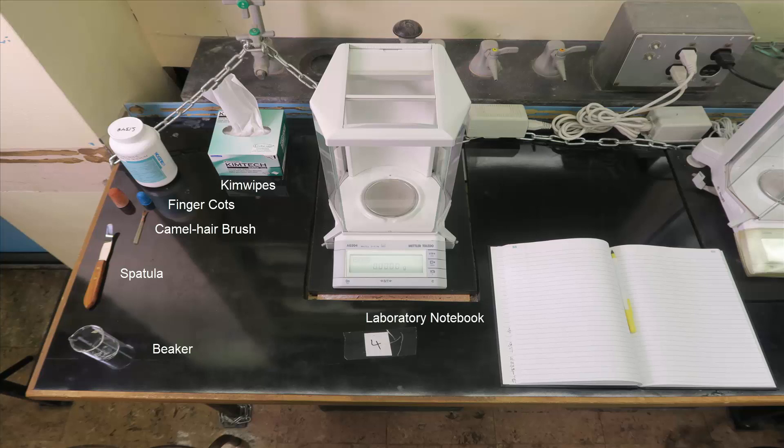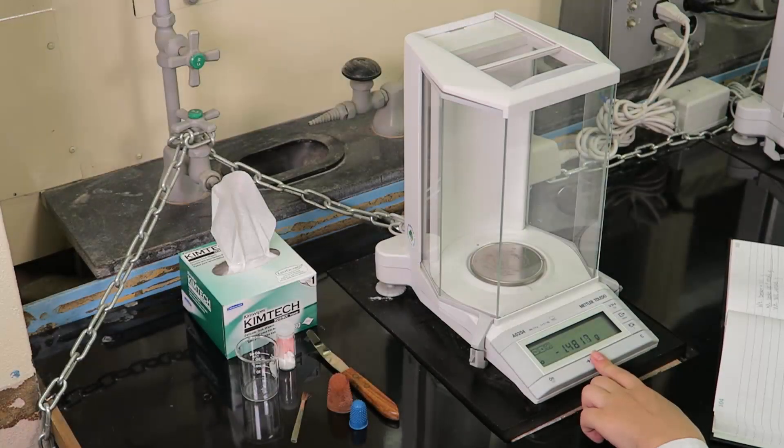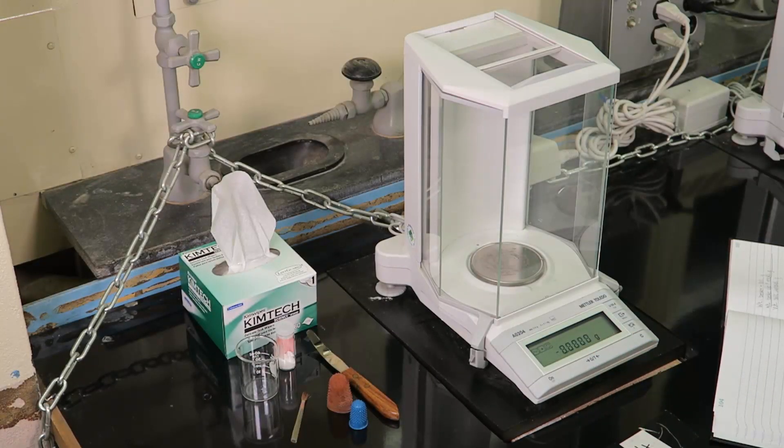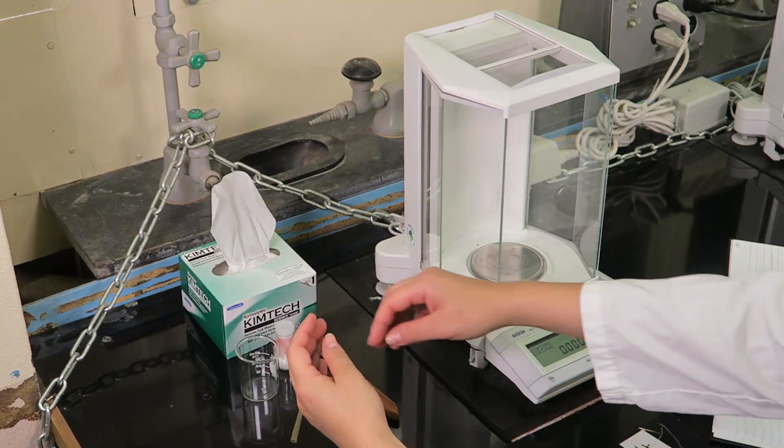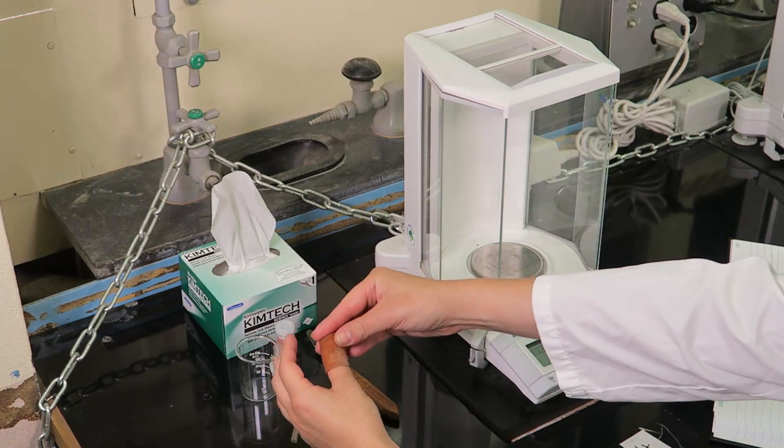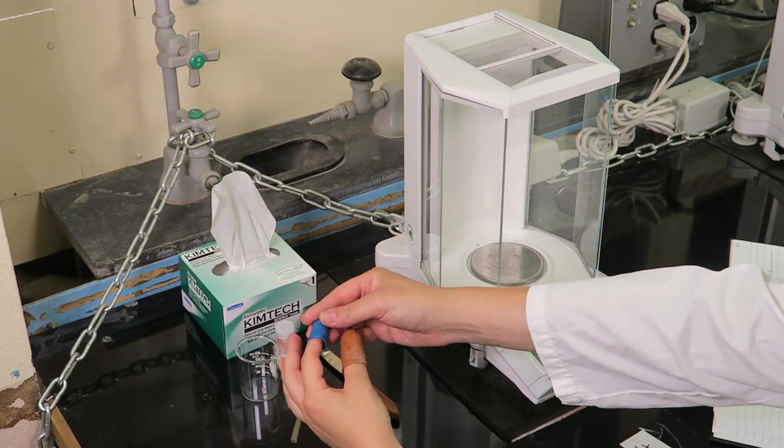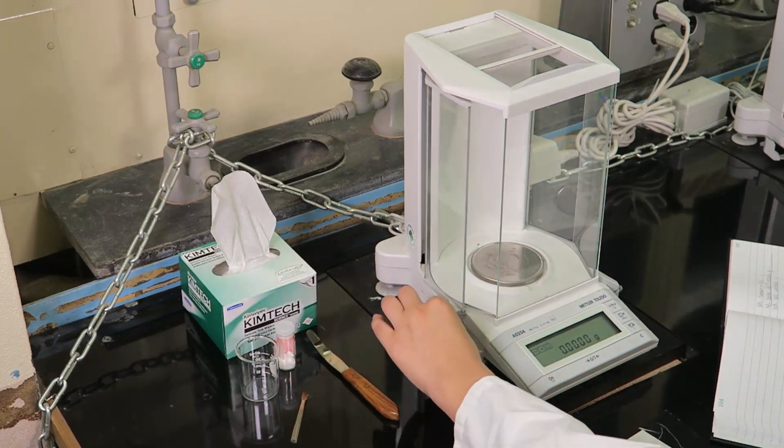Ensure that proper personal protective equipment is used. First, zero the analytical balance with all the doors closed. It is important to handle the compound container with finger cots, gloves, or a kim wipe to avoid adding mass to the container from oils in your hands.